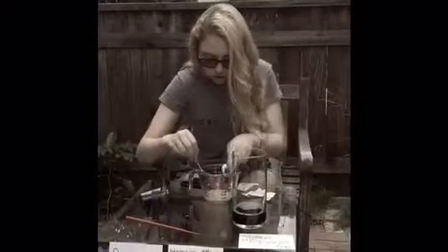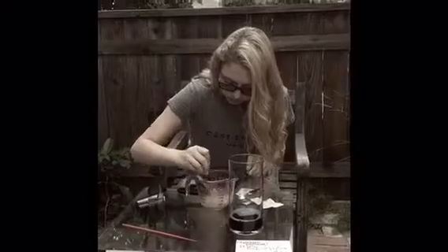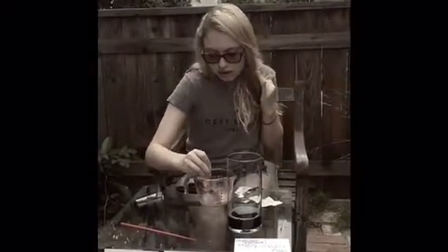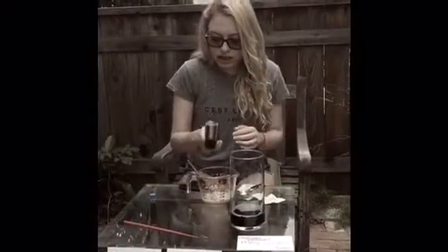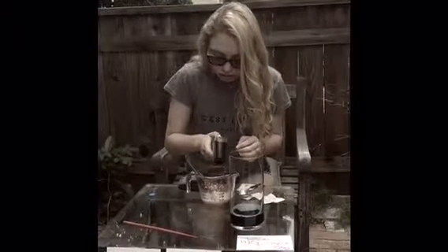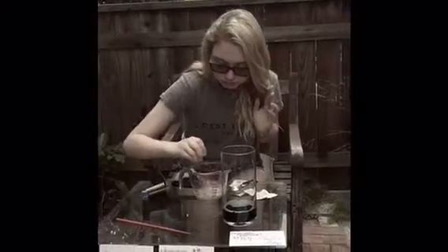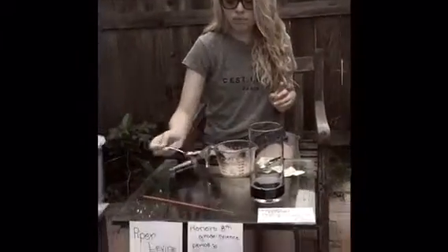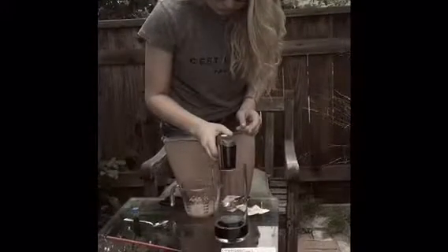So you're going to stir that up. Right now this is at 43 degrees Celsius and 110 degrees Fahrenheit. After you stir that up, this mixture is at 28 degrees Celsius and 83 degrees Fahrenheit.